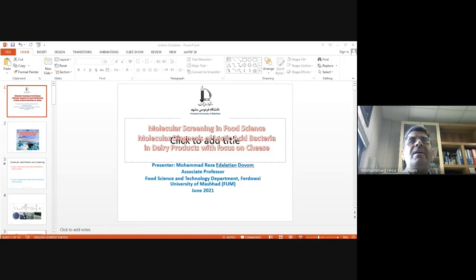In the next slide, I want to explain the steps of culture-independent molecular identification and screening. As you can see here, I divided this category into some subcategories.